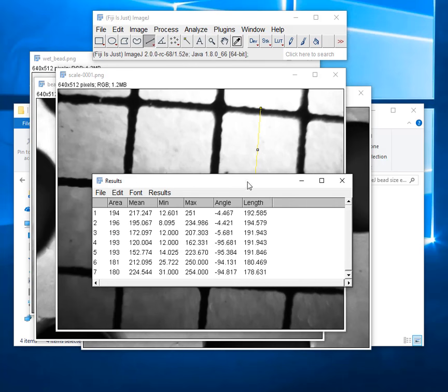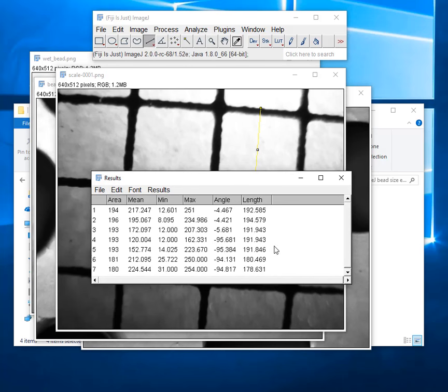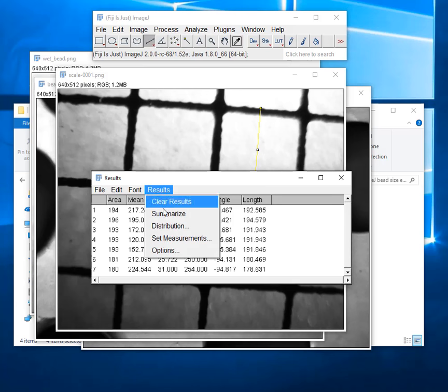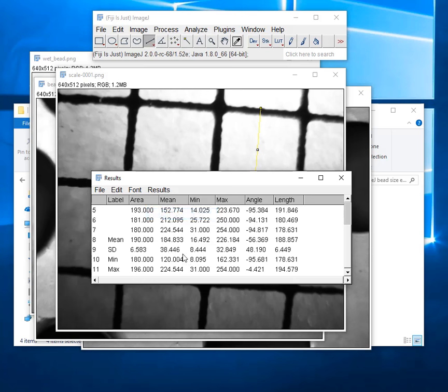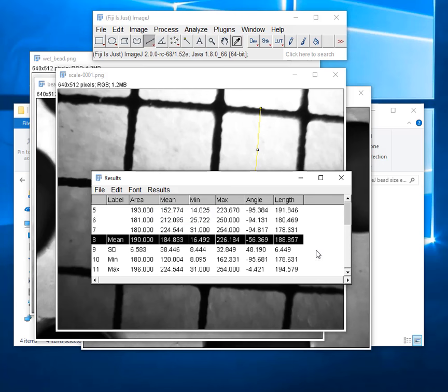So if I bring back up this window see I have all these measurements, some of them get pretty varying. Now I want the average distance so I hit results and summarize and you can see it gives me the mean. The mean length is 188.857 and so that tells me that two millimeters in these pictures equals 188.857 pixels.